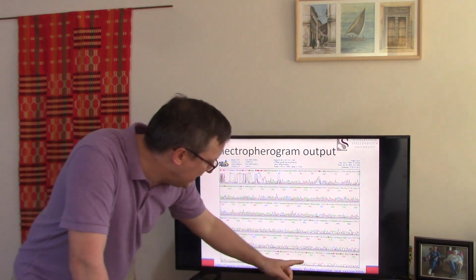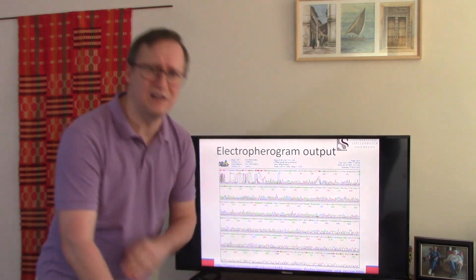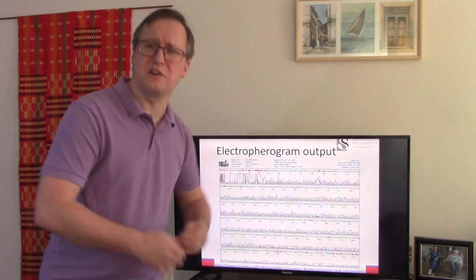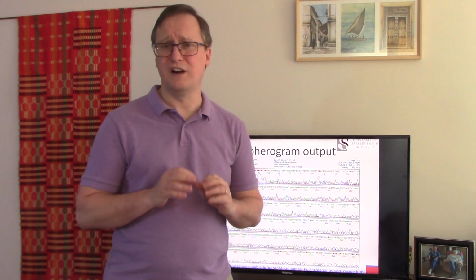So when we look at this region up here around 720 in the electropherogram, we see a green plateau. It's rising and then sort of wiggling back and forth a few times and then falling. We can interpret that that is a bunch of A's, but is it 5 A's? Is it 4 A's? It's really hard to tell. So in cases like that, we see that some parts of the electropherogram are such great quality that it's very hard to miss the base call. Some parts of the electropherogram, on the other hand, are very poorly resolved. We need to be able to put an error probability on each letter of this read.